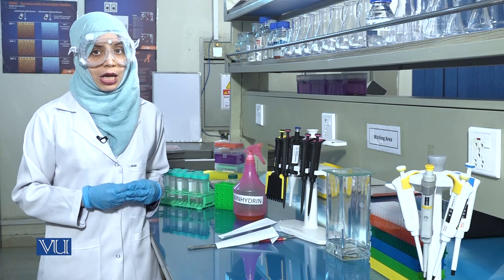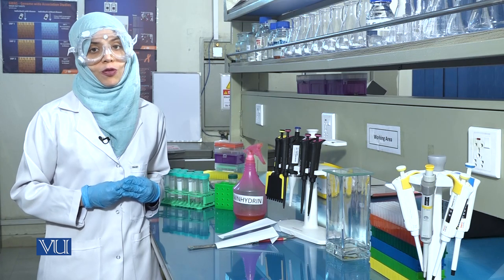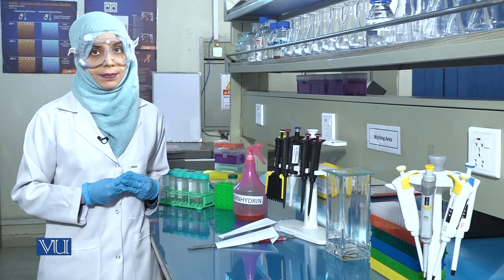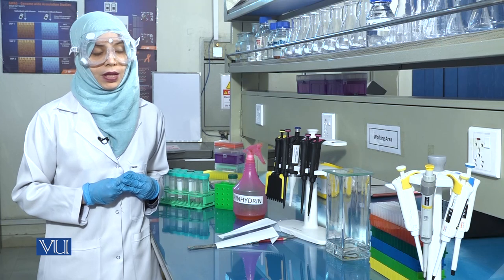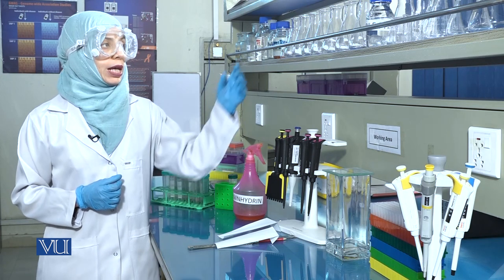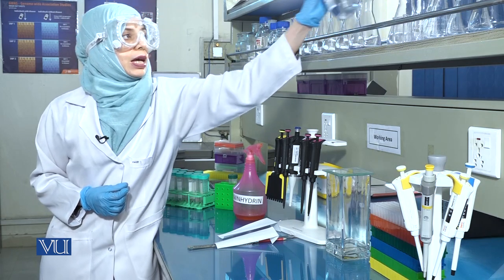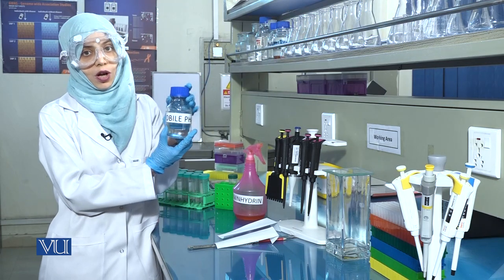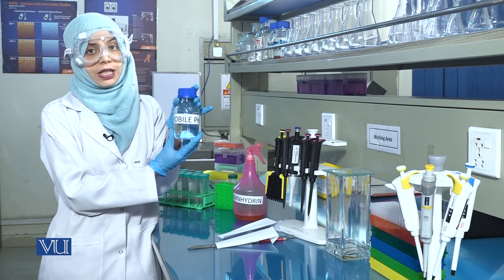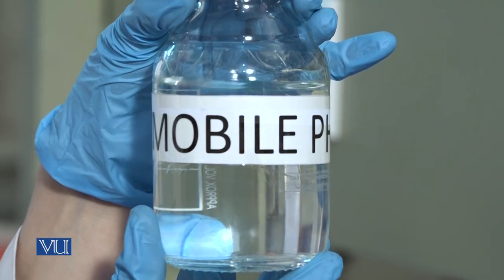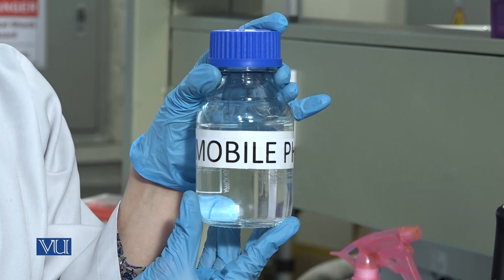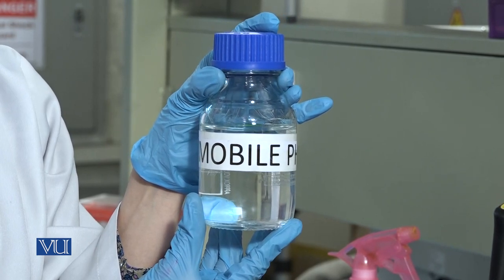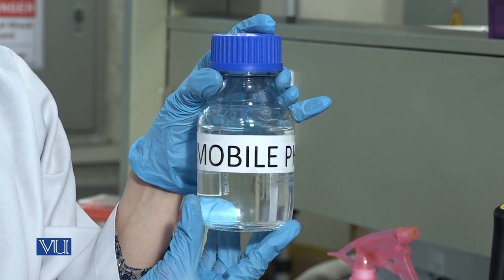Today, we will be performing the paper chromatography of amino acids. To begin with, we will take the mobile phase or the organic solvent, which contains butanol, acetic acid, and water in the ratio 60, 15, and 25.